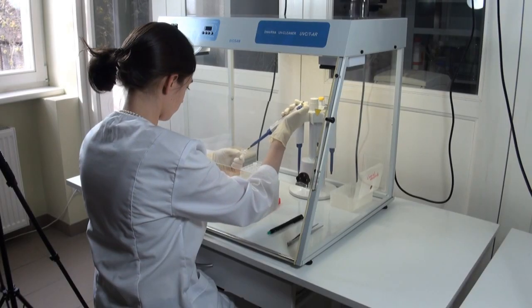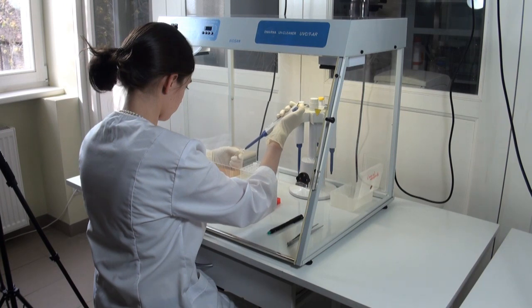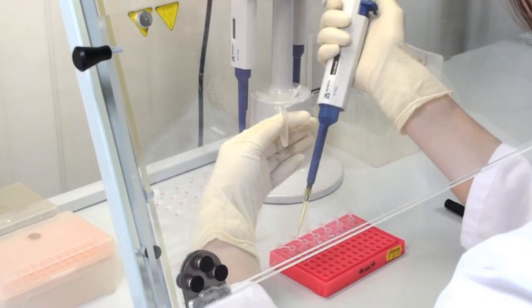UV cabinets are designed for cooling operations with DNA and RNA samples by providing protection against contamination.